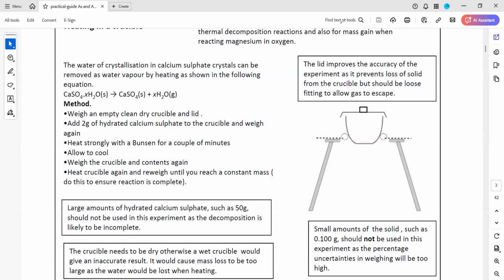Would we have to write these experiments? No, not the full experiments you have to write. It's like the experimental techniques are there. This is how you carry out. So sometimes they ask, like, what should be done? Till what point we should heat the crucible? These types of questions are there.